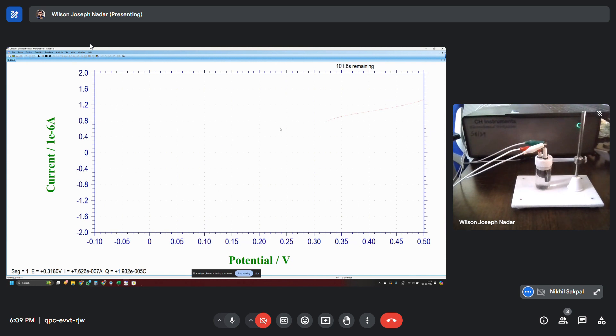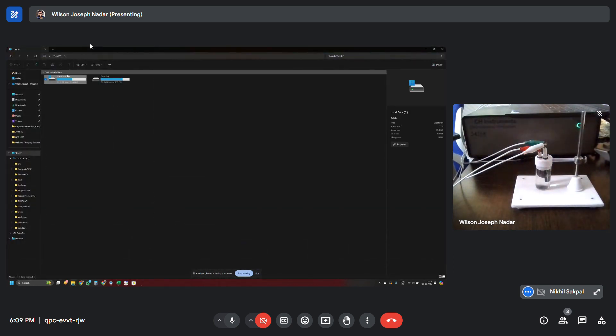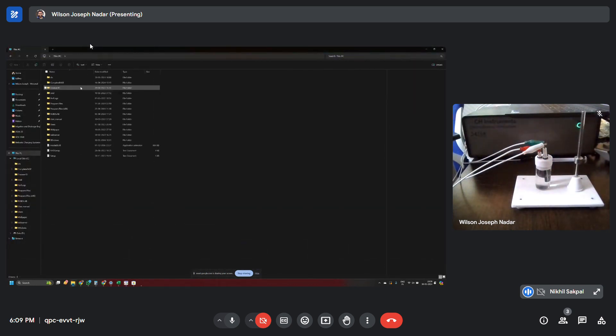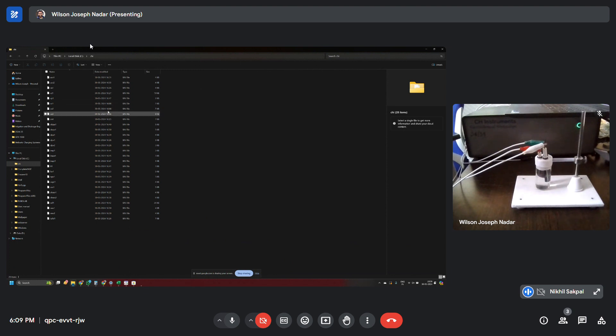So that's it. Now we can find the data from the defined folder C, CCHI. We should have the data done. So these are the data's done now, and the rest of them were, these are the data's done now and the rest of the data's done previously.